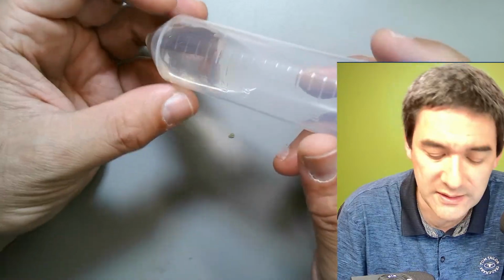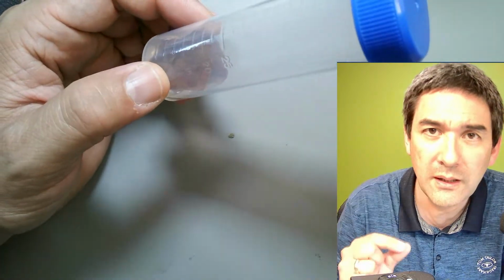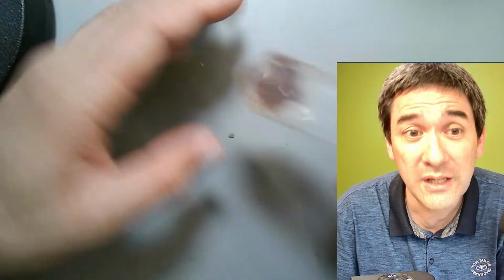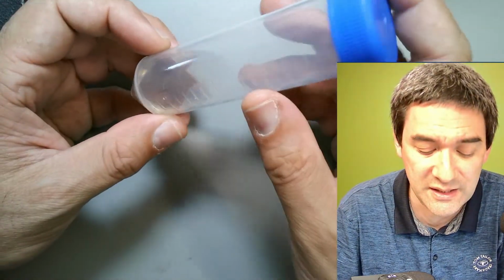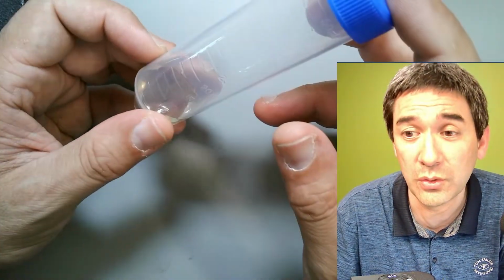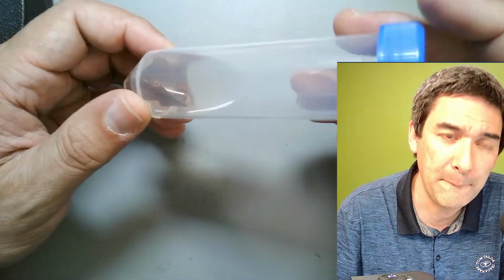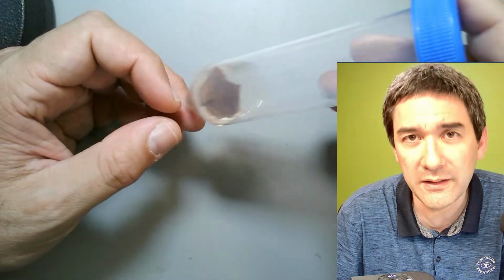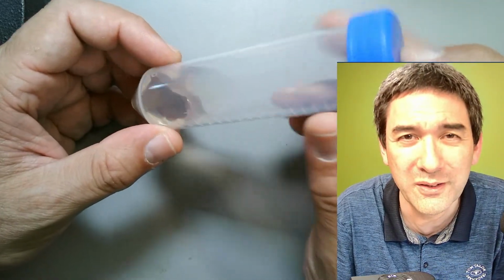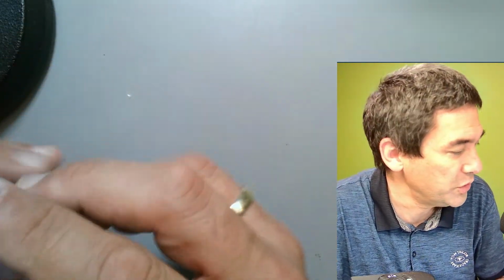So the question is, how do you actually cut those leaves? What you do is you support them by sandwiching them into either a carrot or potatoes. They have the right consistency, and then you can try to use a hand microtome or a very sharp razor blade to cut across. Embedding it in paraffin and then using a rotating microtome and so on is a little bit too much. I don't have the equipment. So that's something I just wanted to share with you. Okay.